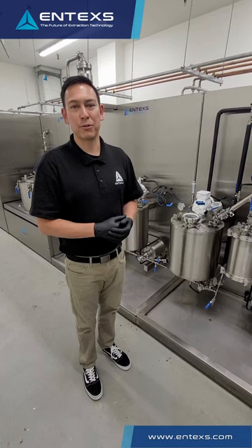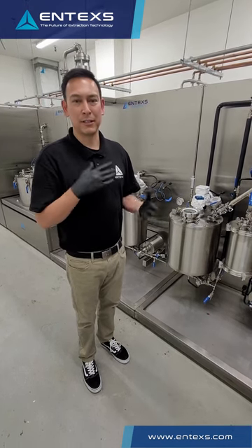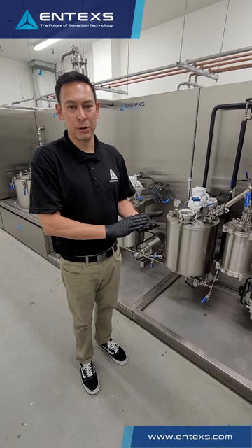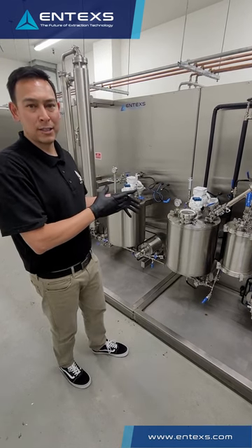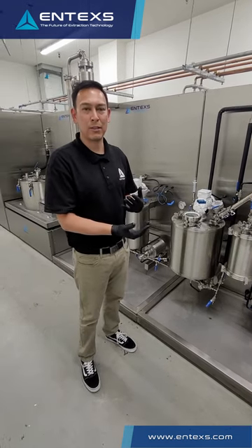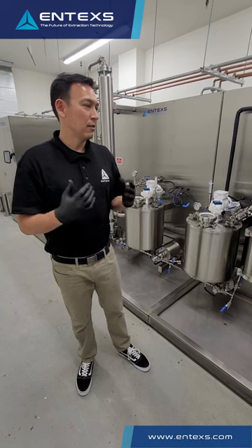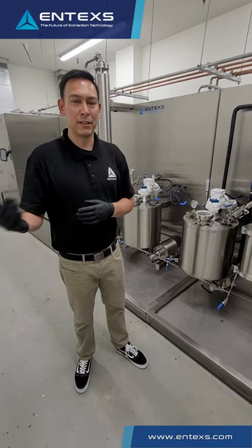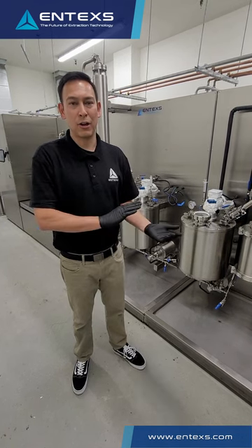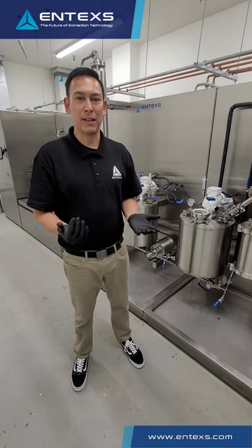We've taken the time to walk through our Mini-3 extraction platform. This is the future of extraction technology. As facilities and customers become more reliant on compliance, pharma GMP and EU GMP requirements, a full closed loop processing solution that meets those stringent quality requirements is needed. That's why this system was developed — to supply those customers and facilities with this type of solution. All of our systems are built in-house in our facility in California, from the conceptual phase through engineering, design, machining, and fabrication. We have a great team that puts these systems together and I'm proud to be a part of the Entex family.